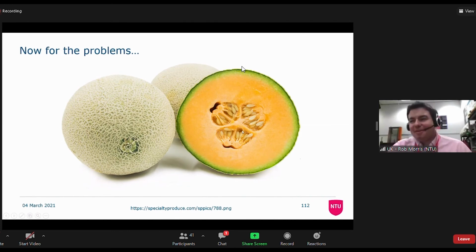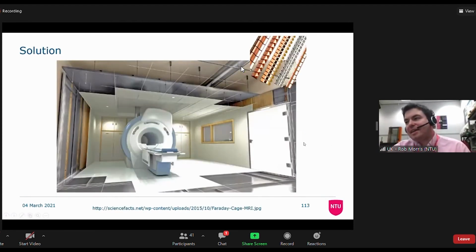On our old one at 100 megahertz, it perfectly corresponded to our local radio station. And we once tried to decrypt it, but couldn't quite manage it. But we used to get dots on our picture at 100 megahertz from the local radio station if we had a big sample in there, because it just picks up the radio signals in the kind of wateriness of its sample and re-radiates it.